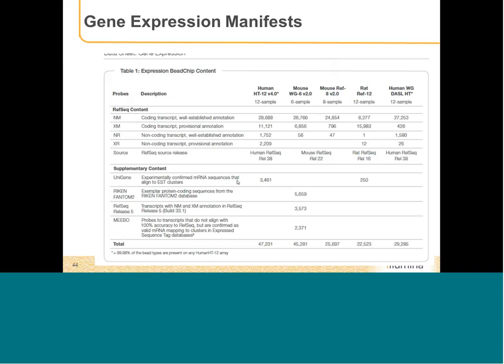These coordinates are not pulled from a genome build, they're pulled from RefSeq or the various different databases that are available, and so we rely on their information. I have looked at some of the manifests here, and while most of them are from build 37, there are a few probes with build 36 coordinates, and there's no way to separate them out easily. So again, the annotations come from the expression databases and not from the genome build.